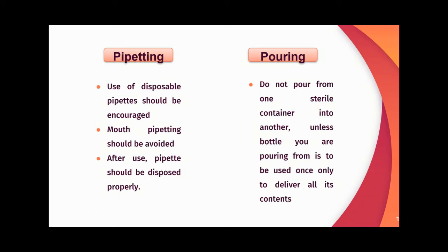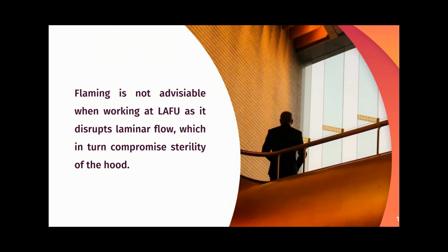For pouring, do not pour from one sterile container into another unless the bottle you are pouring from is used only once to deliver all its contents. Note that flaming is not advisable when working in the LAF hood, as it disrupts laminar flow and compromises the sterility of the hood.